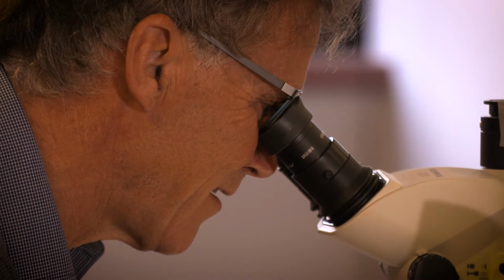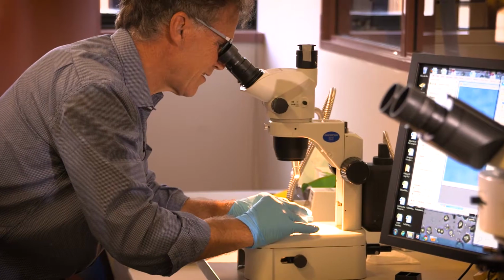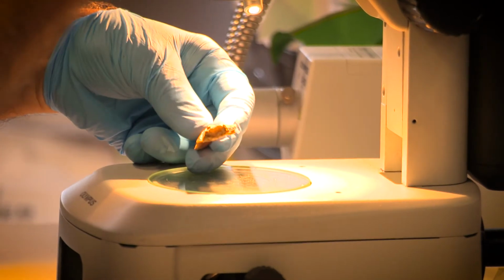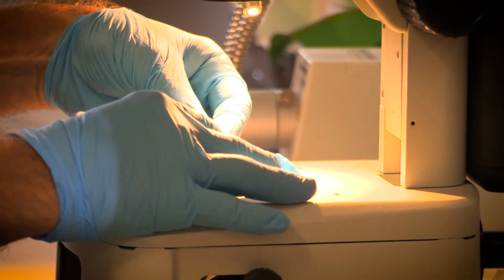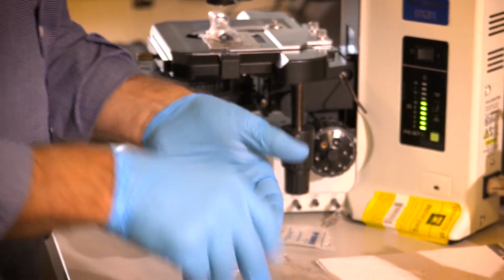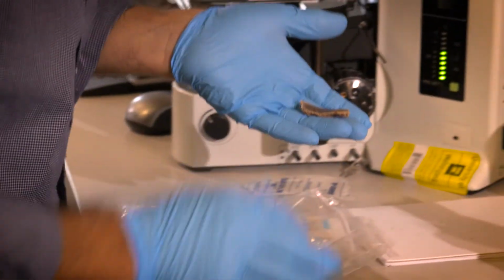So in the laboratory we have to follow a process whereby we can eliminate some of the contamination that could have been left on the samples by the people who excavated the samples, people who put it in storage afterwards, and sometimes even by ourselves just handling the samples.